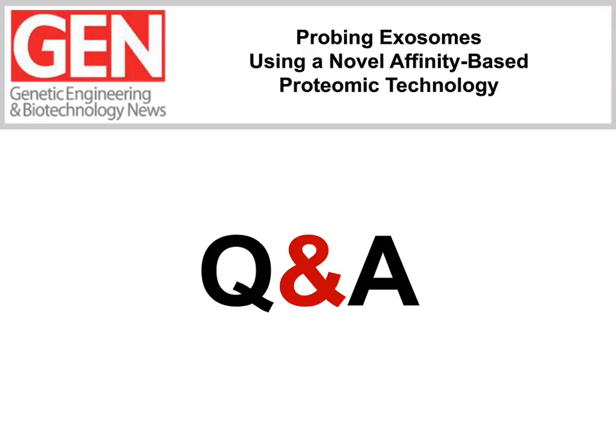So the assay has been validated very carefully by the guys at SomaScan under their set conditions. So I would advise people to tinker with those conditions with care, because although you may get access to the inside of the vesicle, you may also interfere with some of the reagents binding their targets. So do that, but do it with care. I certainly see scope for optimizing how we lyse exosomes and make it compatible with the SOMA assay even better than what we've done already. I think there's some scope for that.